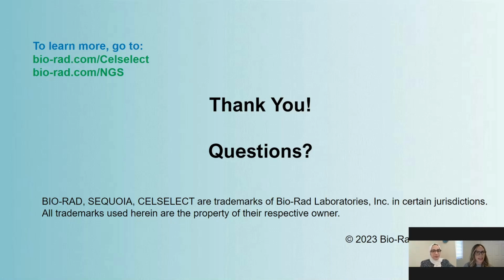Number four, what fluorescent imagers or microscopes can be used for the enumeration protocol? As long as you can scan the Celselect slide with any automated fluorescent microscope, you should be able to use those images with the analysis software. As long as they have up to 6 channels, you should be able to use pretty much any automated platform.